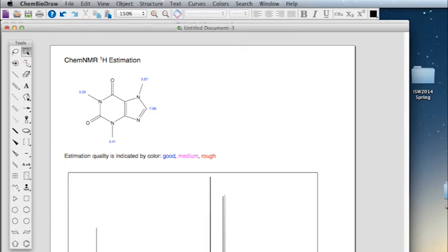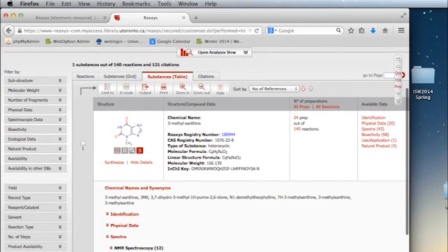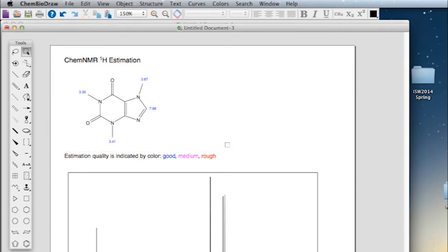It is imperative that students still consult published literature from Reaxys or SciFinder that gives NMR data obtained from similar reactions. Citing existing literature is more credible for lab reports than citing these NMR predictions from ChemDraw. Having said that, generating these NMR predictions is a very good starting point in deciphering the identity of your peaks. Students should generate NMR predictions of their compounds as a part of their pre-lab procedures.